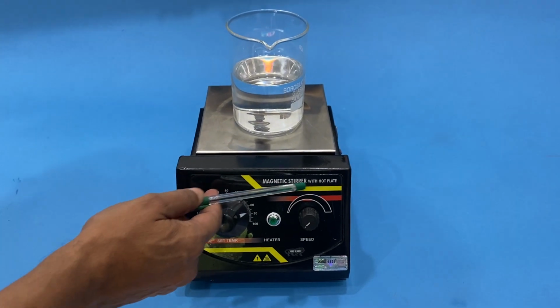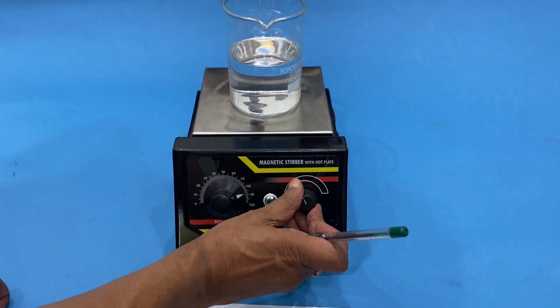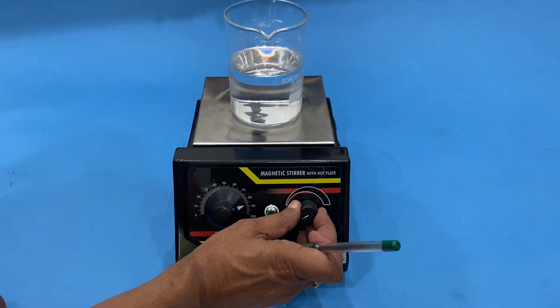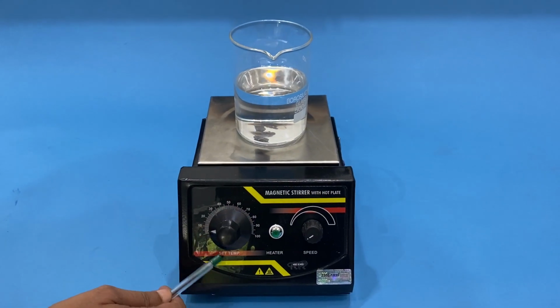This is a magnetic stirrer with hot plate. We have the speed control. Here we can change the speed higher or lower. Better to use the lowest so that the stirring keeps going. And this one is the energy regulator, which is for heating.